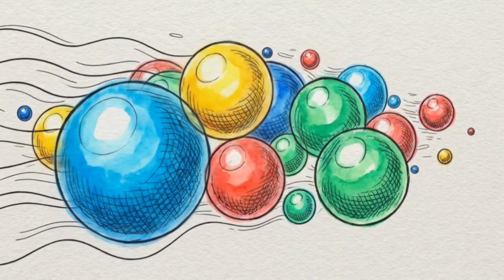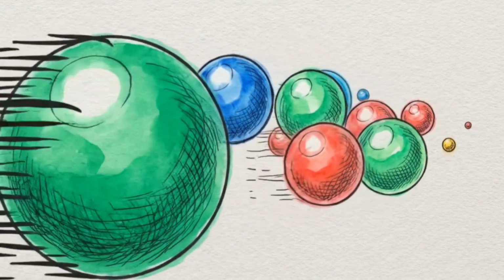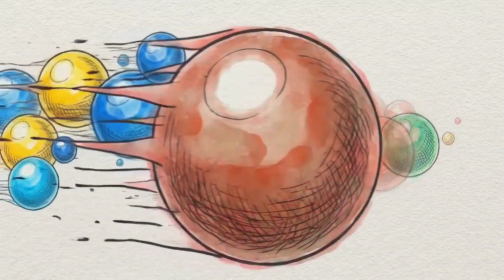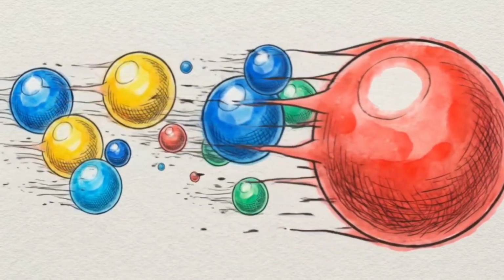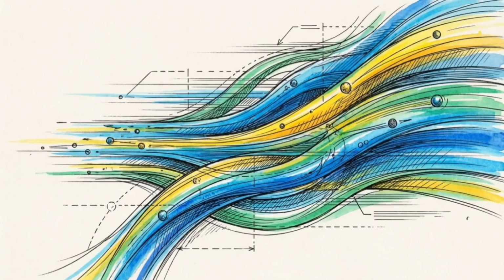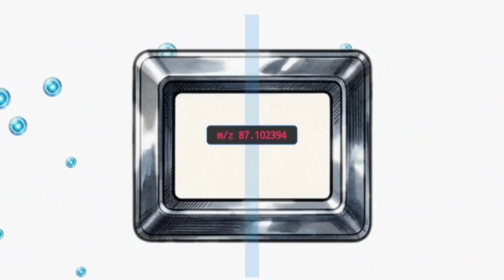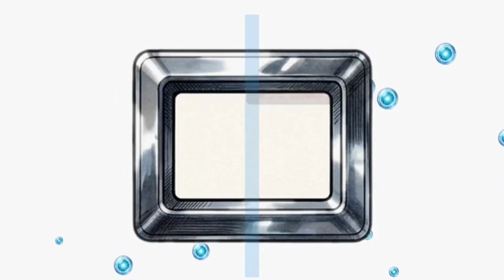Inside a mass spectrometer, identifying an unknown toxin begins with a violent reaction. The target molecule is shattered into dozens of charged fragment ions. These fragments don't emerge in orderly rows. They burst forward as a disorganized stream traveling at several kilometers per second. To identify the original chemical, every single fragment in that stream must be weighed and sorted with microsecond precision.